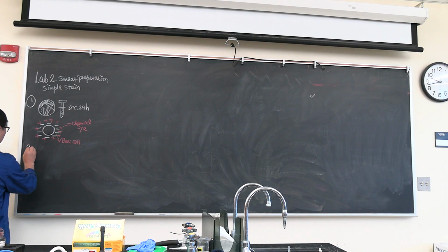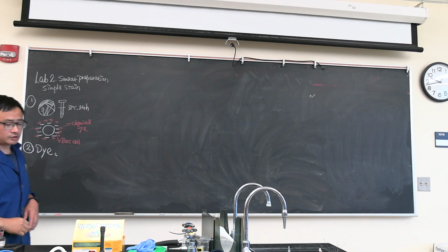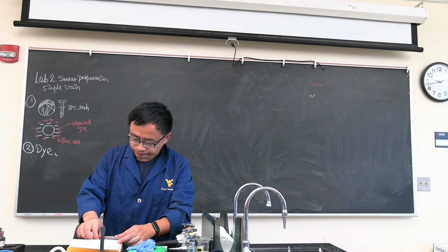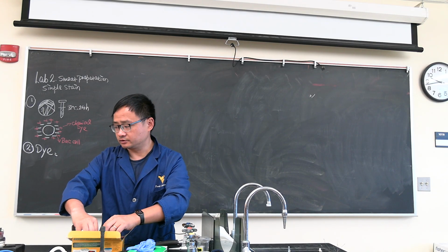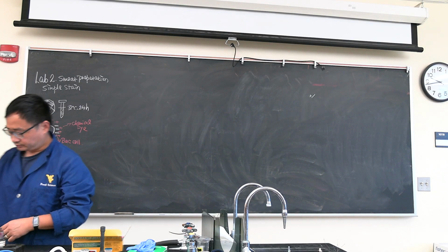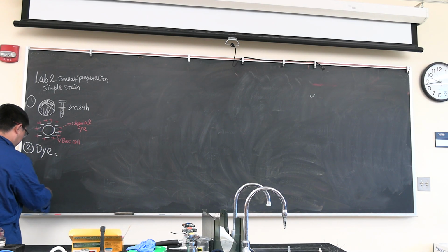Now the next question. What chemical dyes are we going to use, and can we use? There are several we have in the lab, not too many, and you can pick any from them. The first one is very common and looks very purple: crystal violet.